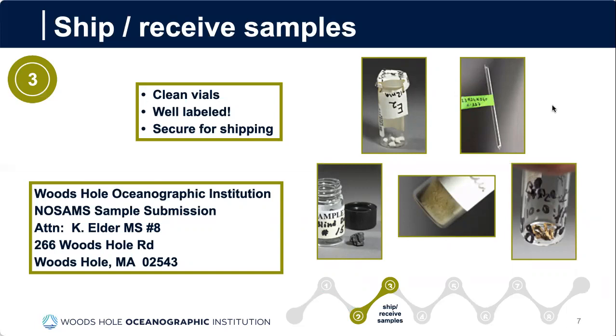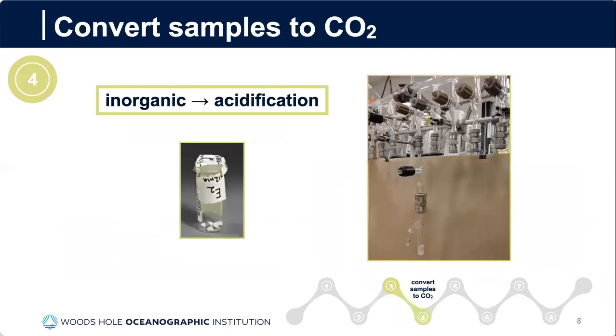When we receive the samples, we will send you an acknowledgement email and look them over. If we have any questions, whether with labeling or any changes or specifics for how we should process them, this is the time where we will start to contact you and begin any kind of dialogue that's needed as we begin to work with your samples. After you receive your samples, check them over and log them in.